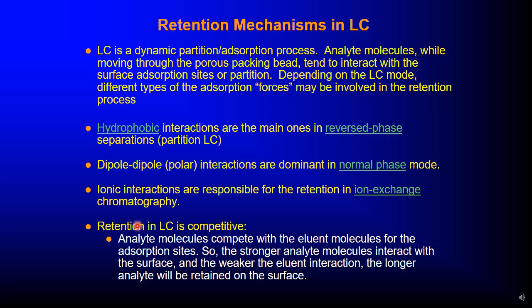Then retention in liquid chromatography is competitive. Analyte molecules compete with the eluent molecules for the adsorption site. So the stronger the analyte molecules interact with the surface, and the weaker the eluent interaction, the longer the analyte will be retained on the surface.